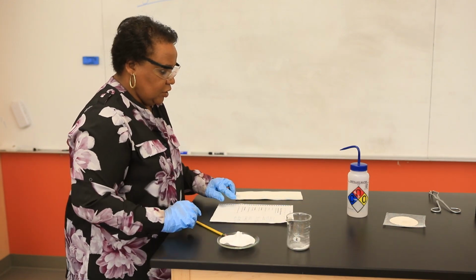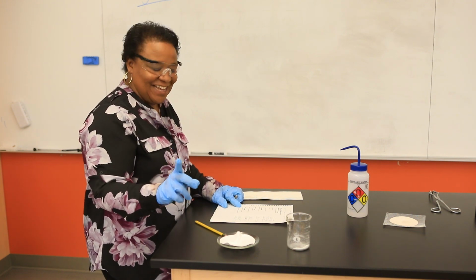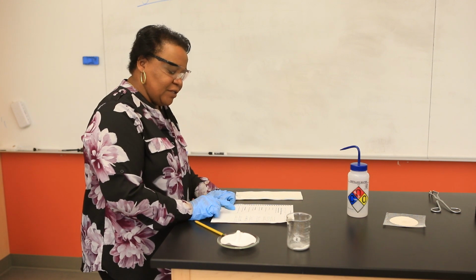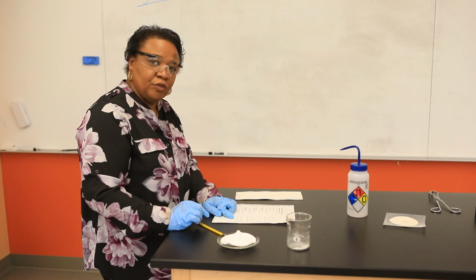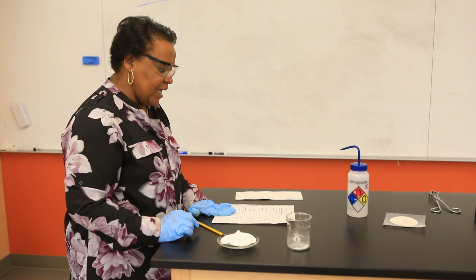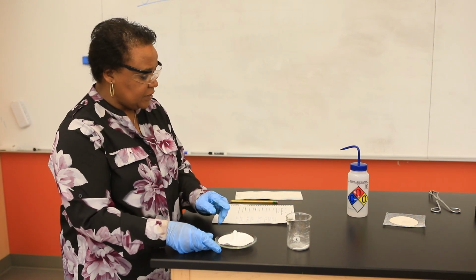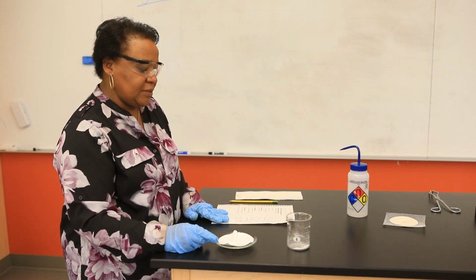In addition to that, you also know the mass of the watch glass and the filter paper. And so again, now you have what? I'm going to give you the mass of the watch glass, filter paper, and the calcium carbonate. That mass is 102.737 grams. And so again, by differences, you should be able to report the mass of the calcium carbonate.